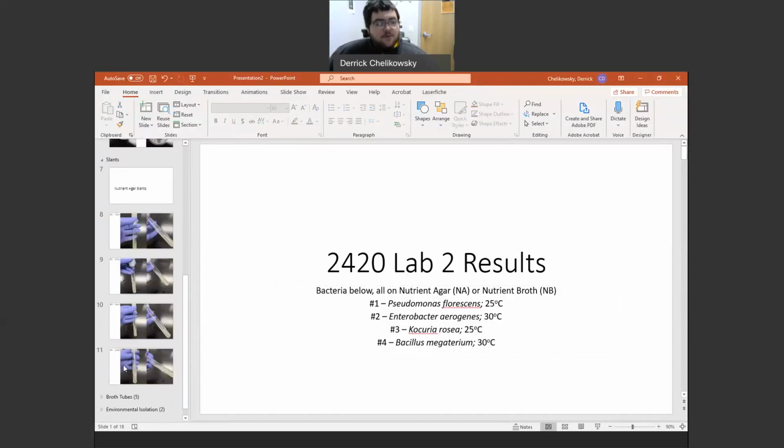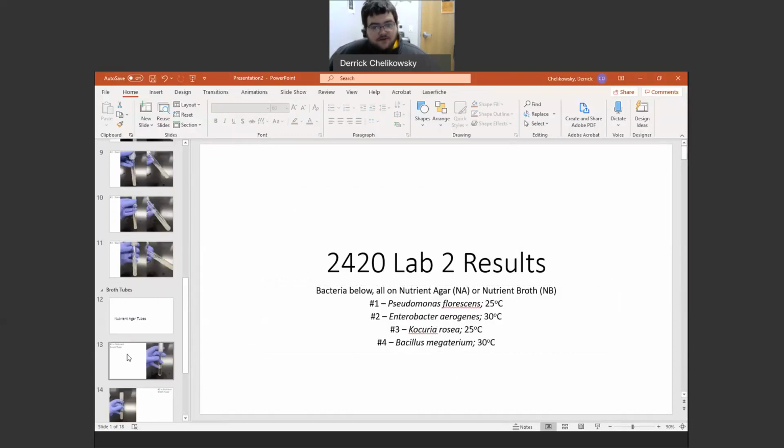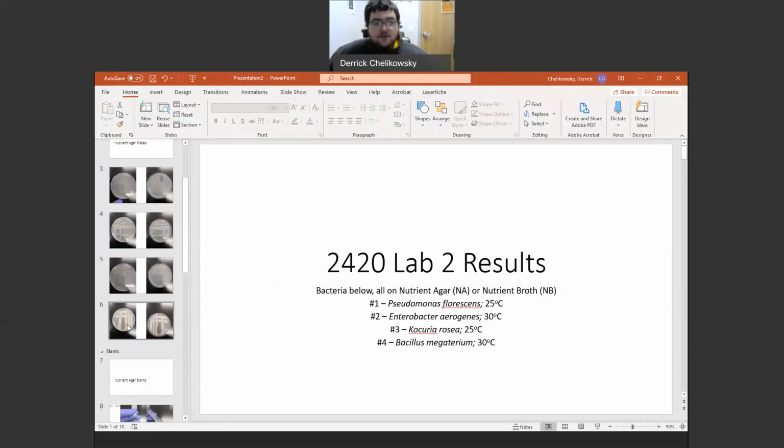In the lab, we would have your TA, myself, Dr. Doyoungin, who would be able to go and show you some more interesting things that happen when we're looking at these bacteria. The goal of this is to show you what you're looking at here and how to use this document for your lab. I do have off to the side here your lab guides and handouts. So we are going to be going through lab guides and handouts, explaining exactly where things are.